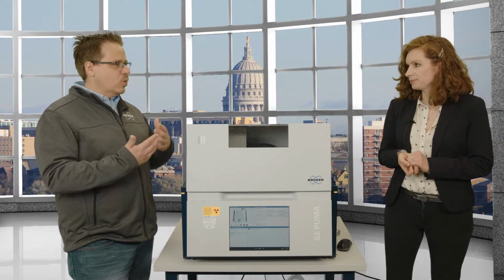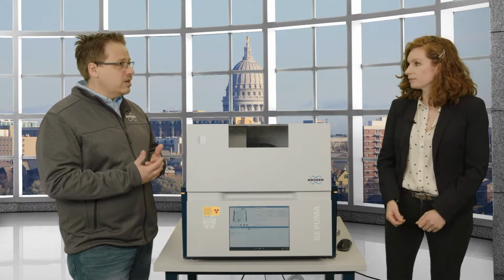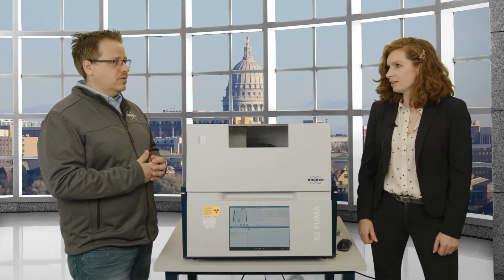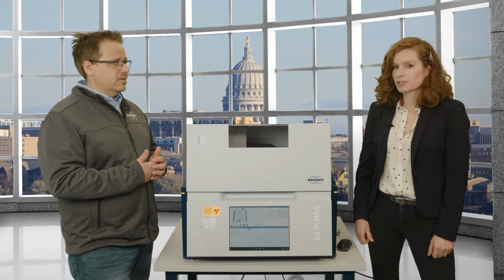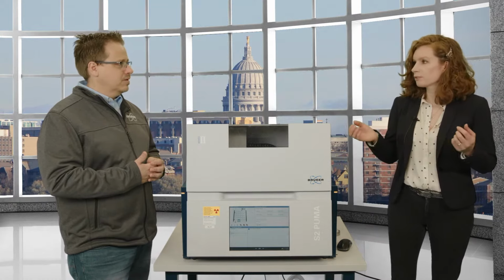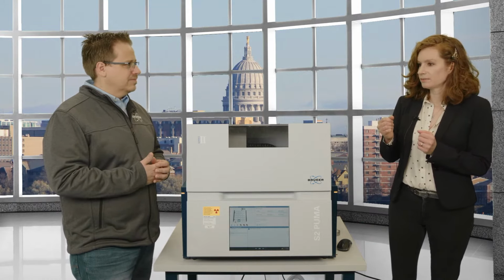If you don't necessarily know what you have, or you could have a huge range of things, it's not the same thing every day, ED might be a little bit better for you. ED also gives you the whole spectrum right away, whereas WD, if you use a standardless method, you also get a full spectrum. But WD is more precise.